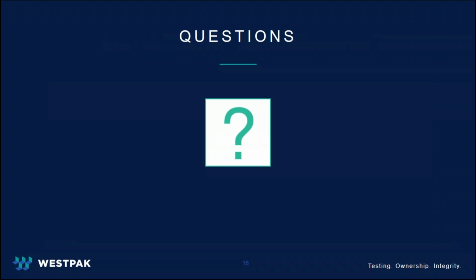Cool. Thanks, Nico. Great information on dye penetration testing. We got a few questions here, and remember, everybody, if you have any questions during the webinar, please go ahead and send them in using the chat pane located near the bottom of the control panel. First question we have is, what is considered a pass or fail in regards to dye penetration? Is a 50% seal, a 75% seal, or 100% seal considered failure?